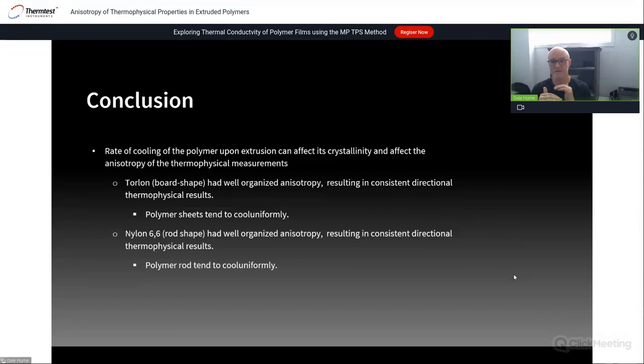So the filler or layers are non-repeating through the thickness, meaning if you measure different time scales with a transient method and you get varying results, the assumptions of that method are going to be broken and create errors in the results. Moving to a steady state method like a guarded heat flow meter or a heat flow meter, those are standards, ASTM standards E1530 and C518. There are, of course, equivalent ISO standards, might be better suited.